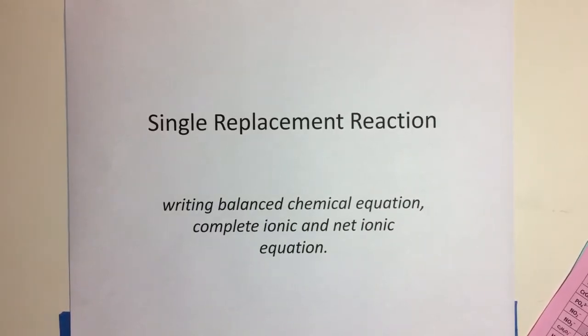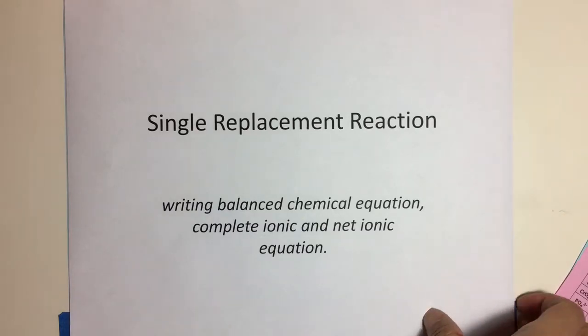We're going to learn about single replacement reactions: predicting, writing balanced chemical equations with them, as well as complete ionic equations and a microscale illustration showing a single replacement reaction. So let's go ahead and make sure you have all your items at hand.